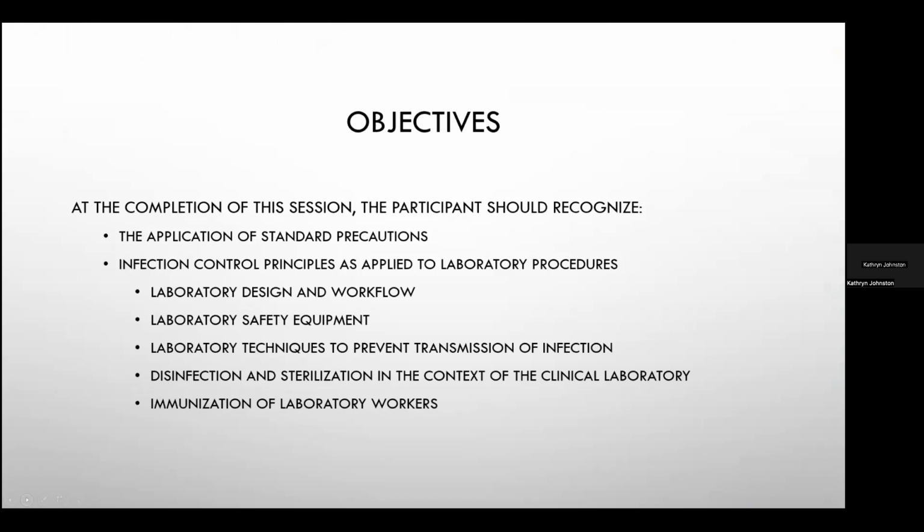So at the end of the session, hopefully you should recognize the application of standard precautions, infection control principles as applied to laboratory procedures, including laboratory design, laboratory safety equipment, techniques that prevent the transmission of infection. I'm going to talk briefly about disinfection and sterilization in general and in the context of the clinical laboratory. And then we're gonna finish off with immunization of laboratory workers.